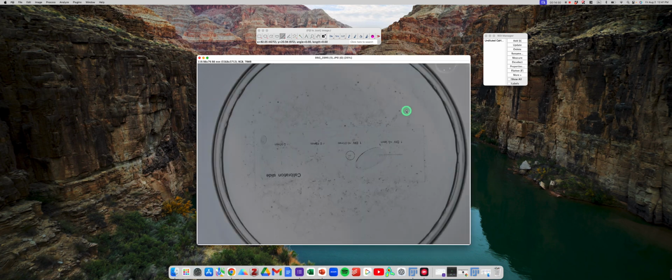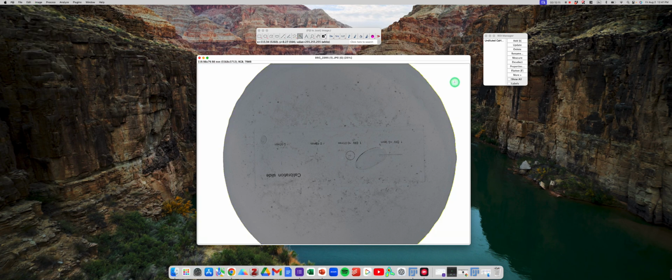Zoom out and apply that same ROI. If you click the wand tool and double click it and your tolerance is at around 40, it will define it within the Petri dish, which is not bad. So however you want to do it, it doesn't matter. And then click Edit, Clear Outside. Now we've got our ROI fairly defined.